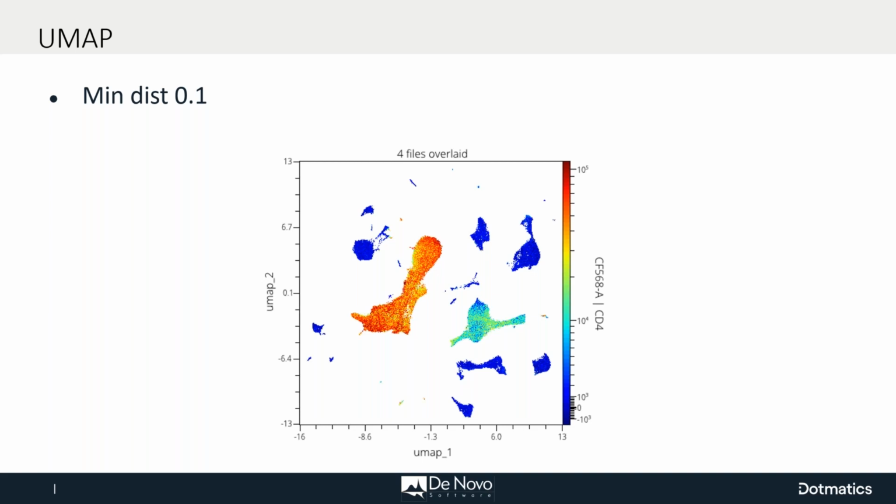I've only got 10 clusters to put my cell in. Which one does it go in? And so UMAP has a lot more freedom to show rare cell types. Like this particular one right here, this is a very rare but very different event because it's very far away from everything else, and there's not very many of the events right there.